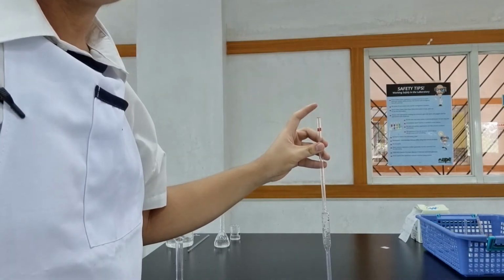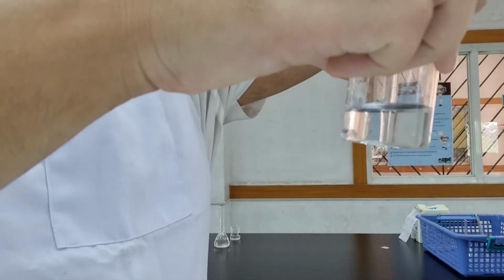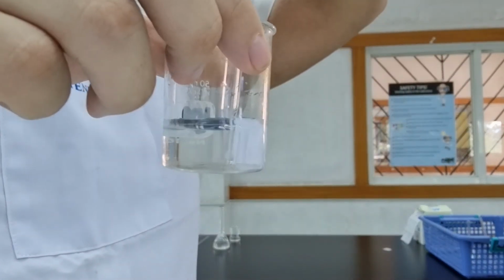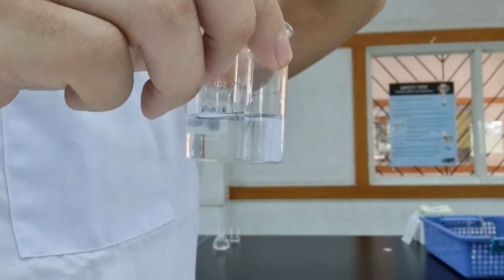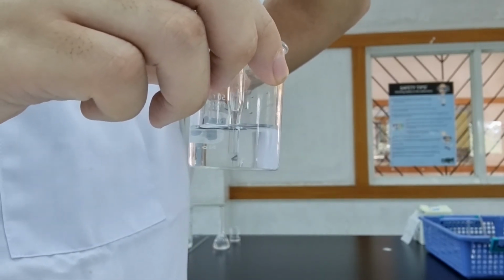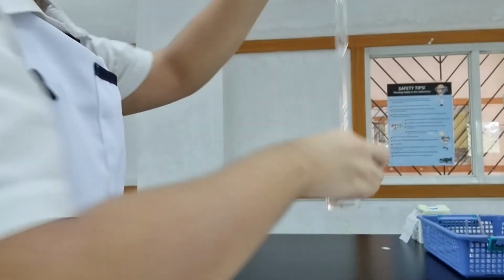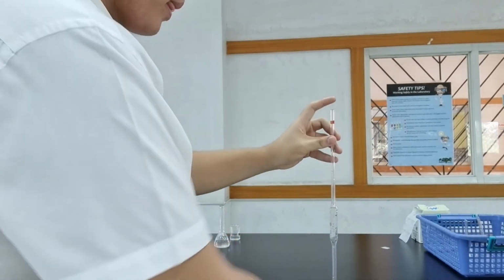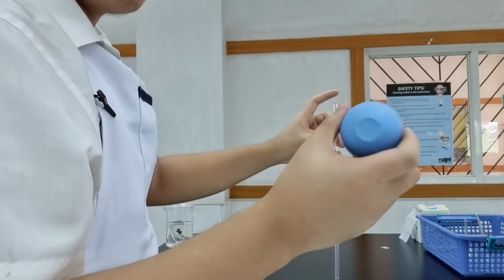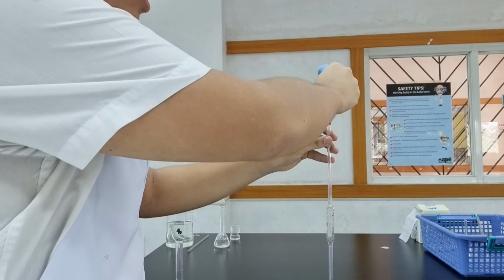I'm going to make sure that the tip of the pipette is not touching the base of the container. So in this case, to allow it to suck up the liquid better, I'm going to make sure that there's some space between the tip of the pipette and the base of the container. I use my aspirator or my bulb, and then I draw up liquid.